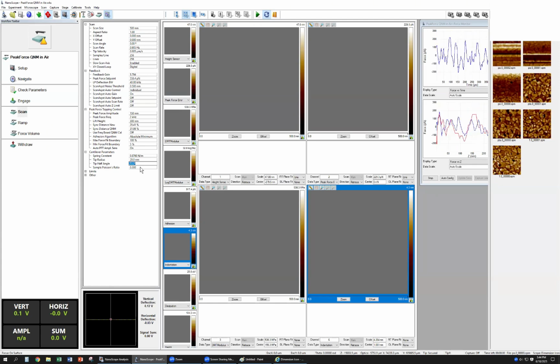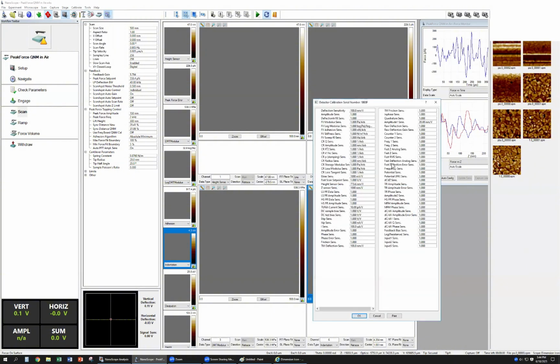The Poisson ratio is 0.3. This 0.3 is given data, not calibrated, because it is too difficult for us to calibrate the Poisson ratio. We have another piece of data we haven't found yet, called the deflection sensitivity. This deflection sensitivity we should put here.